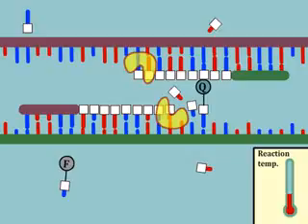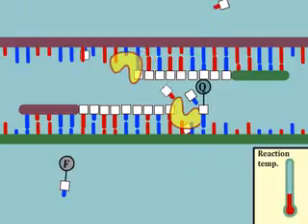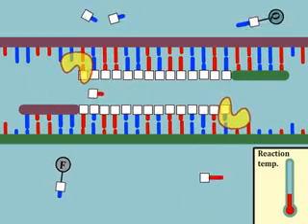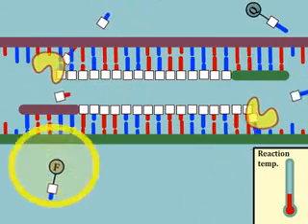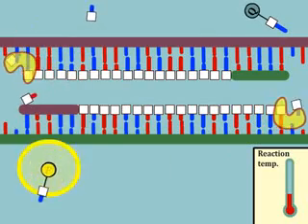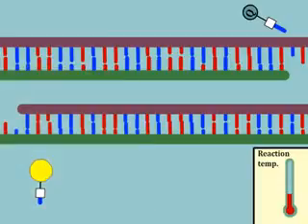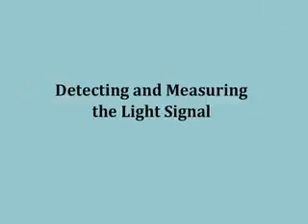As the polymerase cuts through the probe, note that the nucleotide bearing the fluorescent marker and the one bearing the quencher are separated from one another. In the absence of a nearby quencher, the fluorescent molecule can now emit detectable light when stimulated. Each time another amplicon is produced, another fluorescent marker is released from its neighboring quencher.